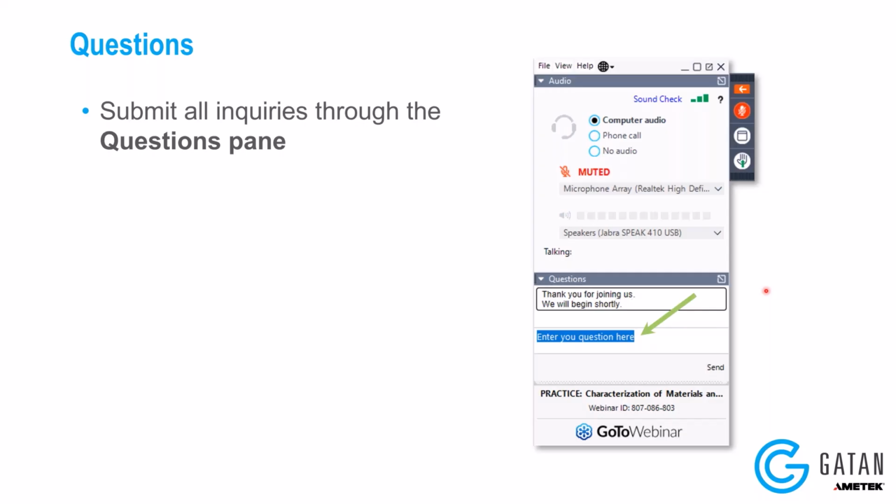Okay. The next one is, how fast can data be captured with STEMx precession? That's a good question. With STEMx precession, you should think of it as a multi-pass 4D-STEM experiment. The speed of acquisition for 4D-STEM in general is limited by the speed of the camera that you are using and the frame rate of the camera.